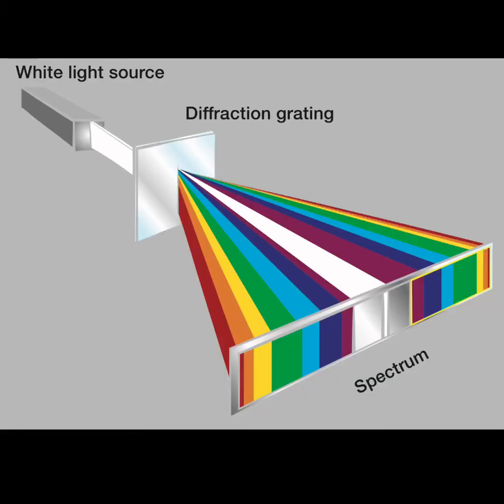Like sunlight, the white light emitted by a light bulb includes several wavelengths of visible light. A diffraction grating separates these different components of visual light. Thousands of closely spaced grooves etched onto the surface of the diffraction grating interact with the different wavelengths of light passing through and diffract the waves at different angles. Each separated wavelength of light corresponds to a different color.